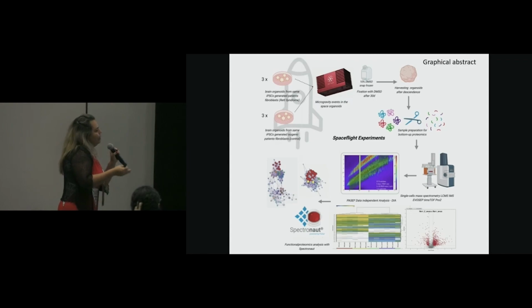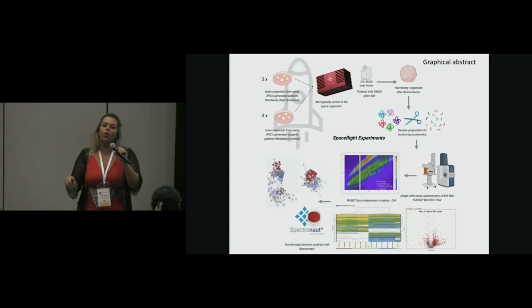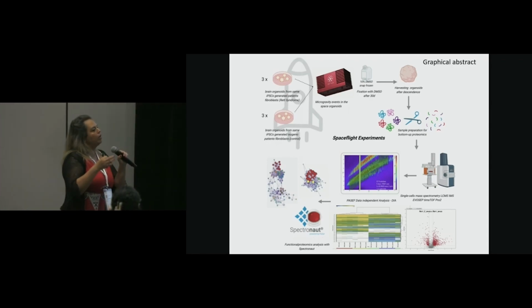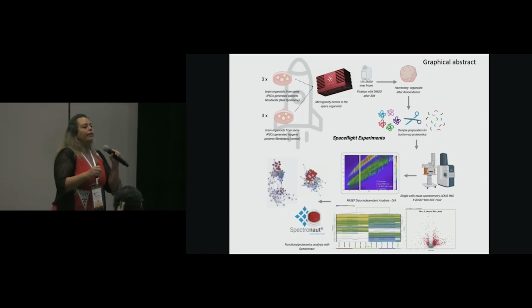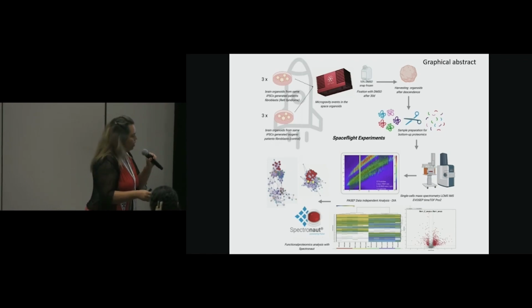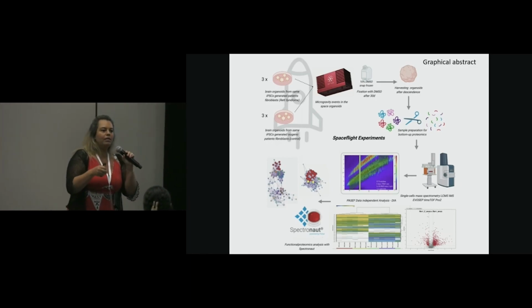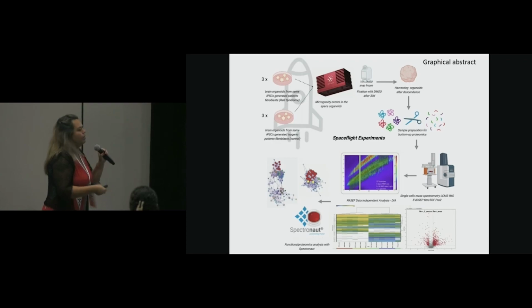We did this in triplicates, and we also had access to control patients. These control patients are directly related to the patients with Rett. We did the same thing to extract the fibroblasts and generate the stem cells. This is really important because these controls are isogenic, so we didn't have any kind of bias.